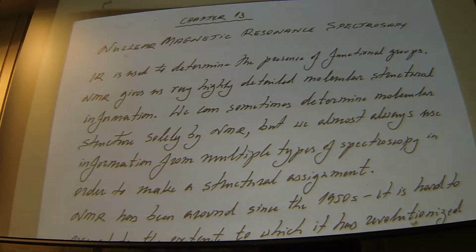Okay, so it doesn't. The nuclear just refers to a property of the nucleus called spin. Not every nucleus, but certainly the nuclei of protons. Certain isotopes, a rare heavy isotope of carbon, phosphorus 31, fluorine 19, and so on.